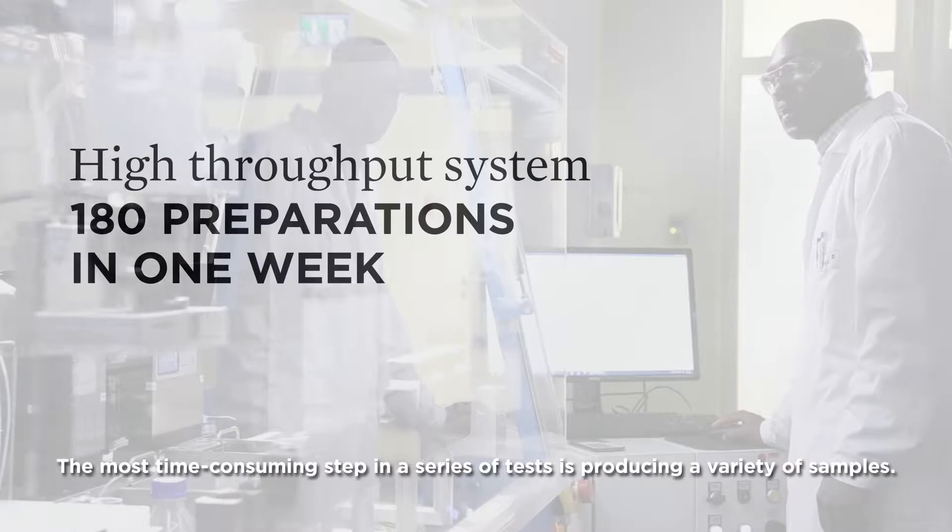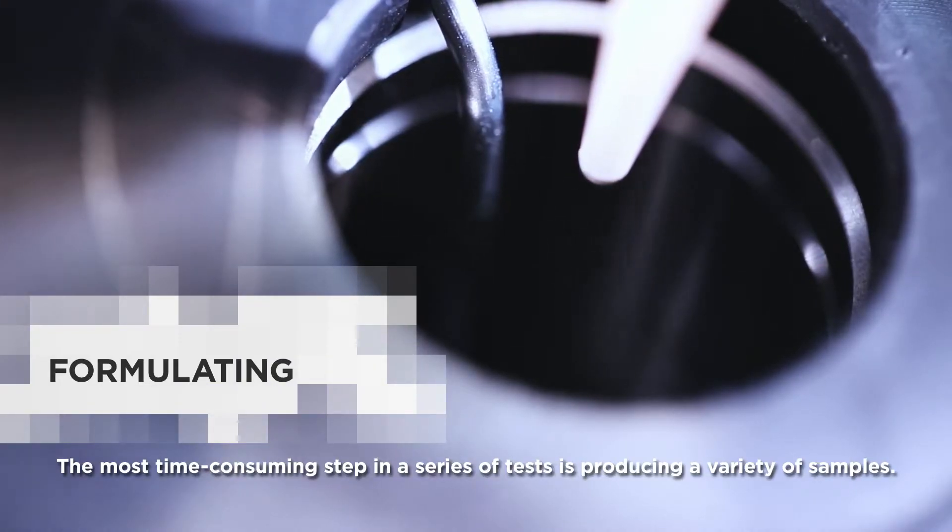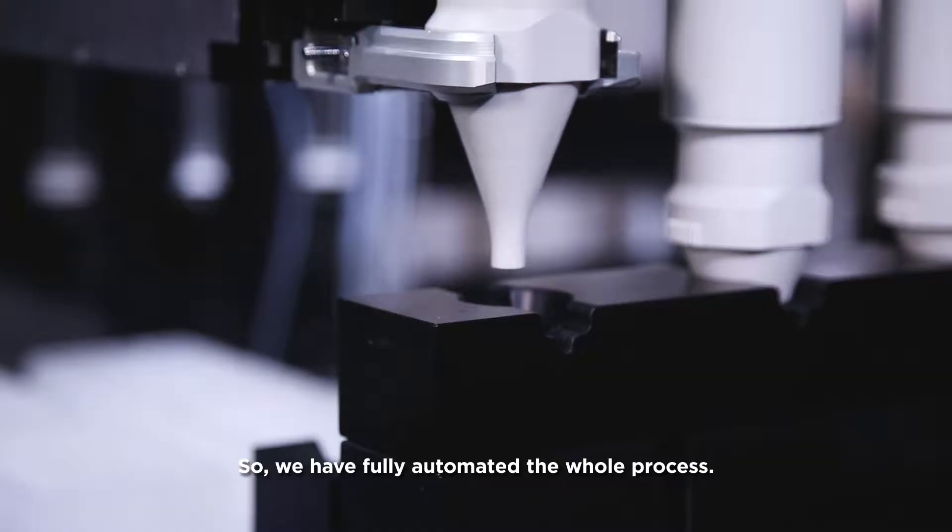The most time-consuming step in a series of tests is producing a variety of samples. So we have fully automated the whole process.